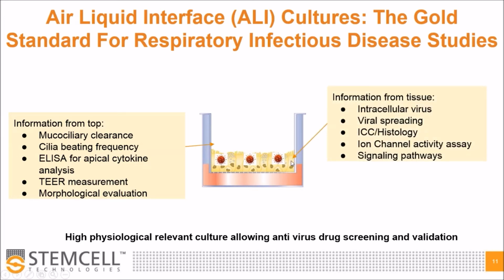Scientists can also get information about the cells, looking at intracellular viruses, viral spreading, characterization by histology or ICC, perform ion channel activity assays, or study signaling pathways. Other information can also be retrieved from the basolateral side of the culture system by looking at cytokine release and LDH release.